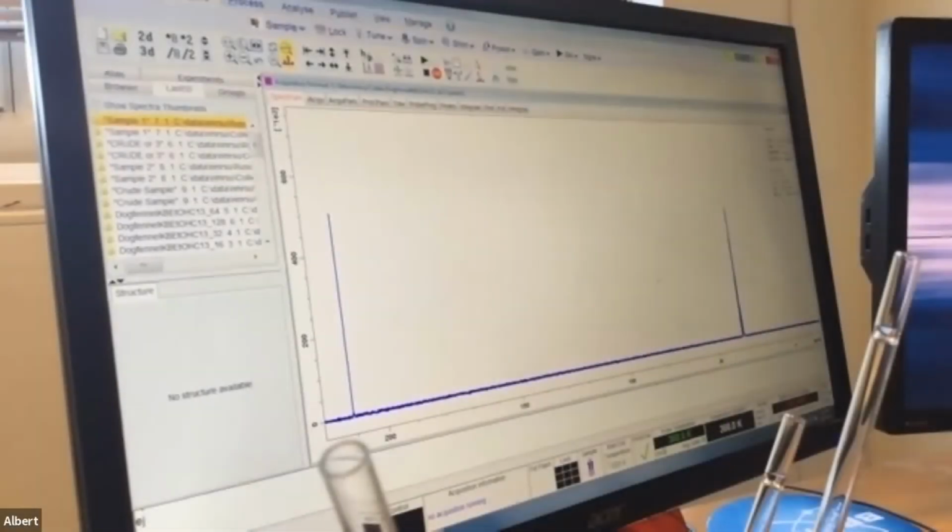All right, so we're going to come over here. Type EJ. It's a Unix. All this stuff is on Unix programming language. So EJ is going to eject the sample that's in there. So just hit enter.